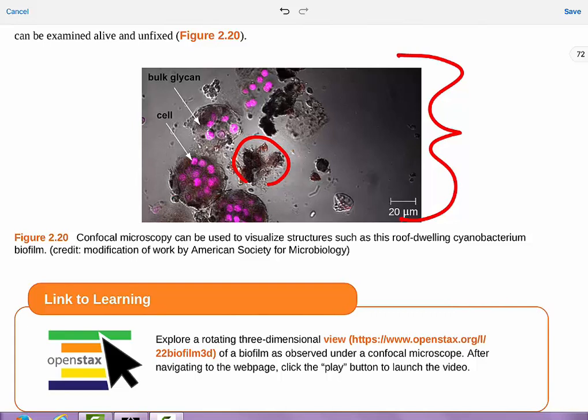depths. And that can be very confusing and frustrating when trying to get something focused at one single depth. In this case, we have a biofilm, which is basically a whole bunch of bacteria stuck together, and they create this film, biofilm, around them to congregate and stay together. This is very helpful for looking at things like that, rather than looking through a Brightfield microscope where you really can't get anything into focus because you're just going through those different planes.